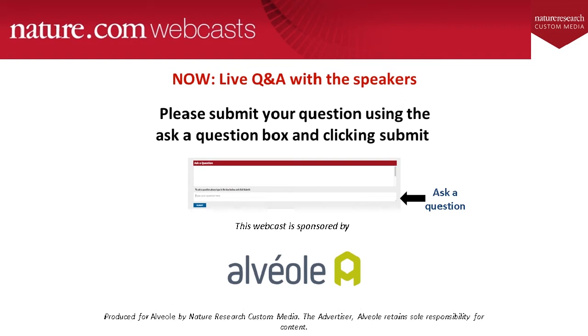So there's a lot to be found in the literature about optimizing the micropattern for the kind of question that you're interested in. And so what I would do is I would look at mechanobiology literature, which is also really interesting because you have the traction force microscopy to give you a sense of what's going on with the cells in a big picture sort of way, and then adapt those to your grid.